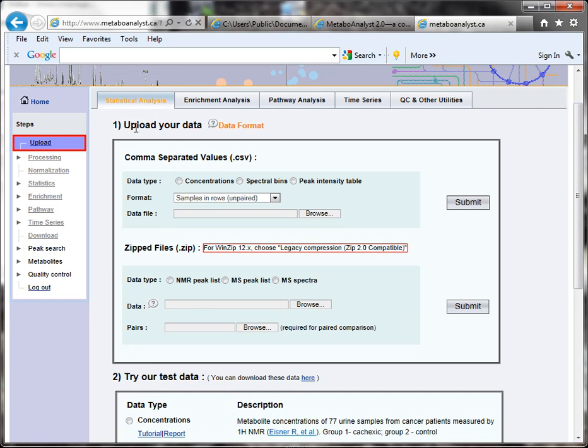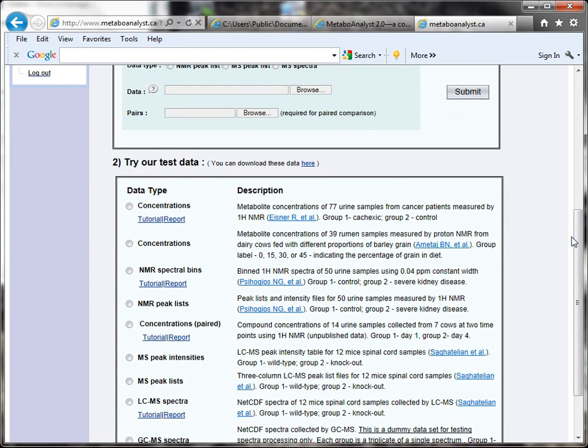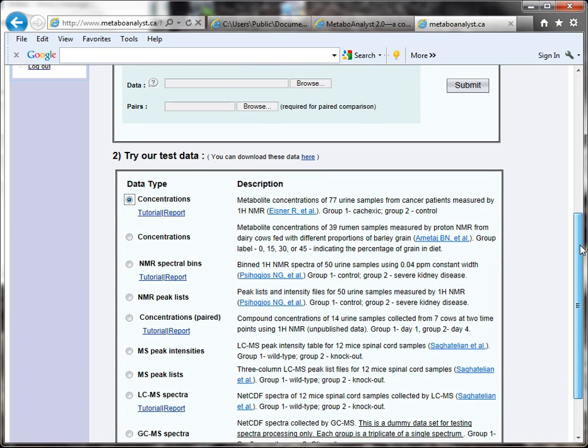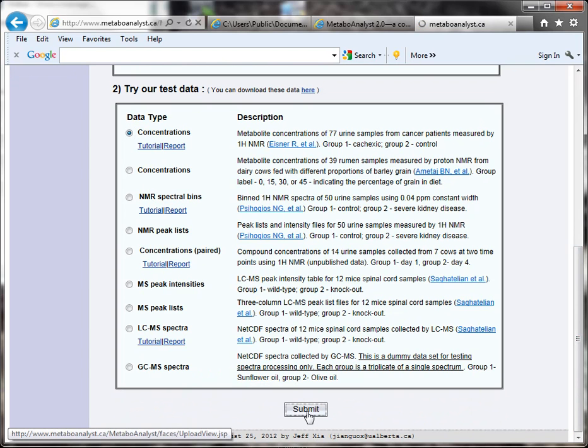You can upload your data, and they also allow you to try various sample datasets so you can get an idea of how this resource works without actually having to have the data yet. I'm going to click on this example set for concentrations—you can read the description here—and then I'll just click Submit.